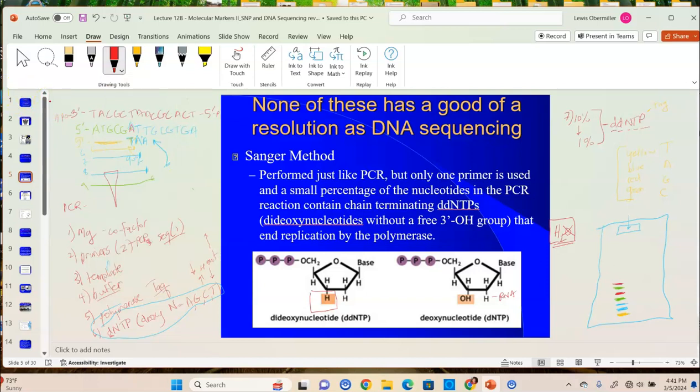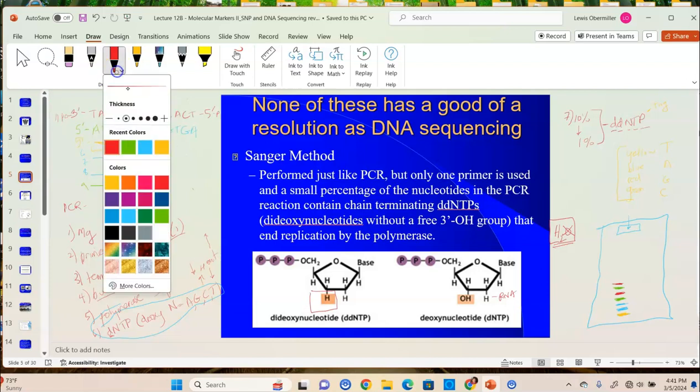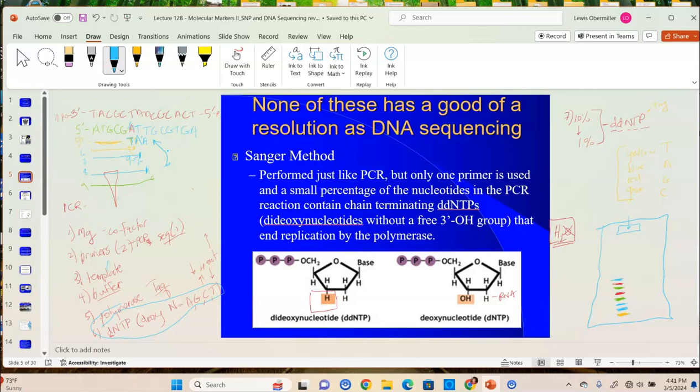G, C, G. And then the next one would be an A would be incorporated in here, and we made A's blue. So you get a blue there. And then the next one would be C pairs with G. Actually, I think I'm doing this on the complement, but it doesn't matter.